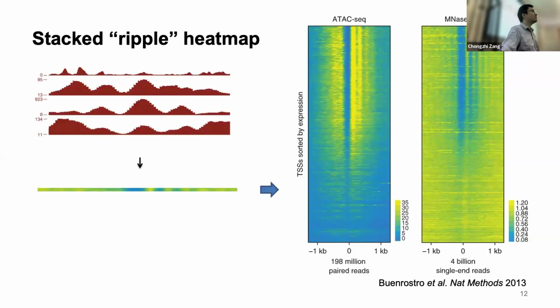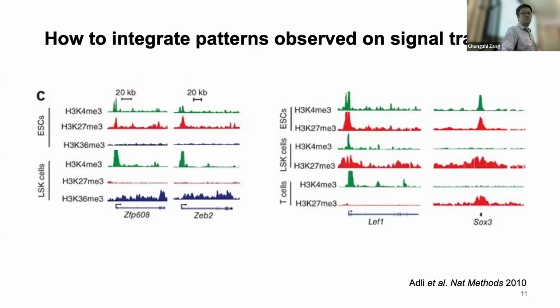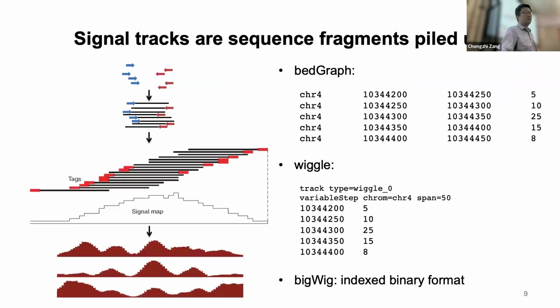When do you decide you want to do paired reads, and when do you want single reads? Whether it's paired end or single end actually depends on the sequencing experiment. If you want paired ends, the sequencer will directly give you the sequences from both ends.